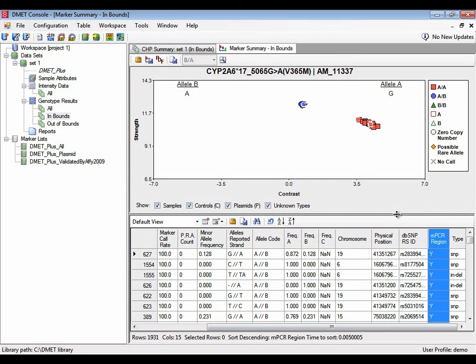You can use the marker summary window to do a number of other things. For example, you can take the data that was used to generate these plots and save that data to a file in case you want to use another tool to look at the data. There's another way of getting these results. You can save screenshots of every one of the markers that are in this table to a PDF file. It will save 8 marker plots per page. Or you could just save this one particular image to a file or copy to the clipboard. That's what you can do with the top pane.